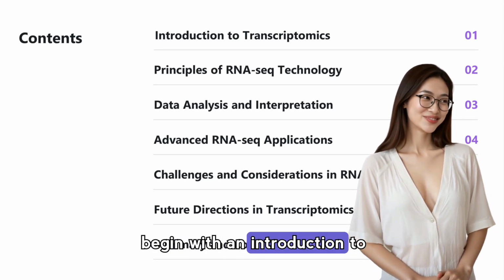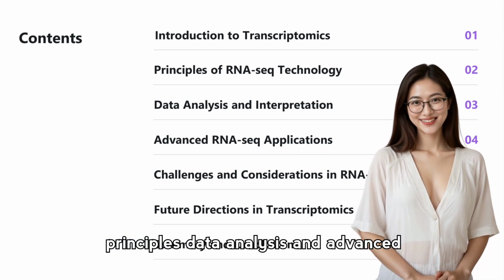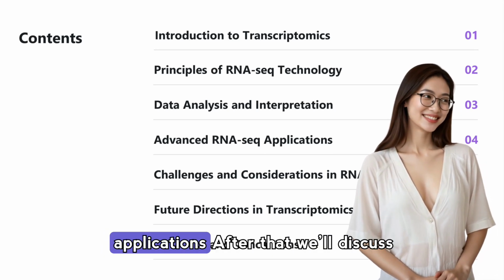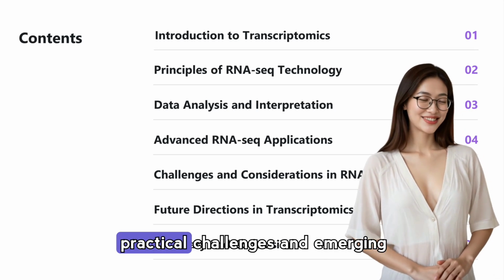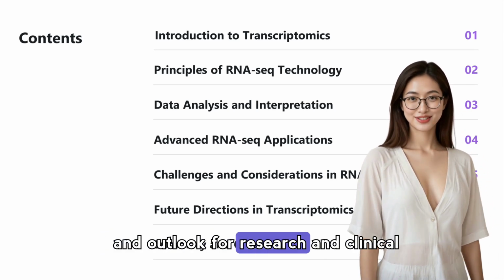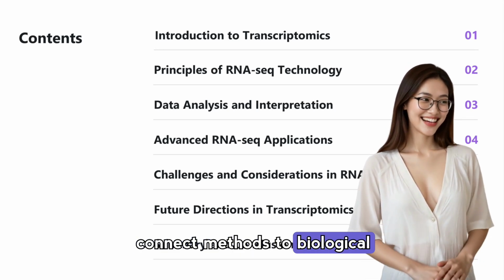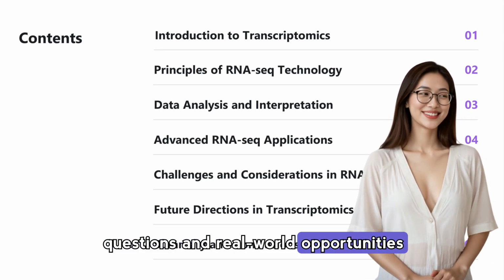We'll begin with an introduction to transcriptomics, then cover RNA-seq principles, data analysis, and advanced applications. After that, we'll discuss practical challenges and emerging trends before finishing with a summary and outlook for research and clinical use. This structure will help you connect methods to biological questions and real-world opportunities.